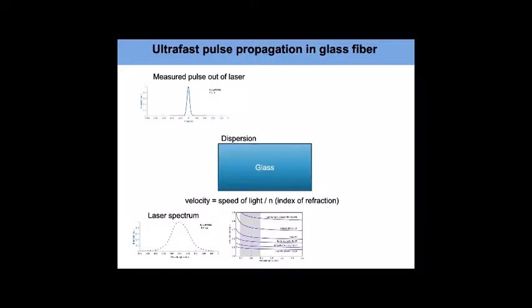Okay, so using these fiber bundles works very well when we're talking about one photon imaging, but you run into trouble when you're trying to use these types of imaging fibers with intense short pulse lasers. The first thing that happens if you're trying to use a short pulse femtosecond laser for your two-photon microscopy is that you have to deal with the chromatic dispersion of the glass in your fiber.